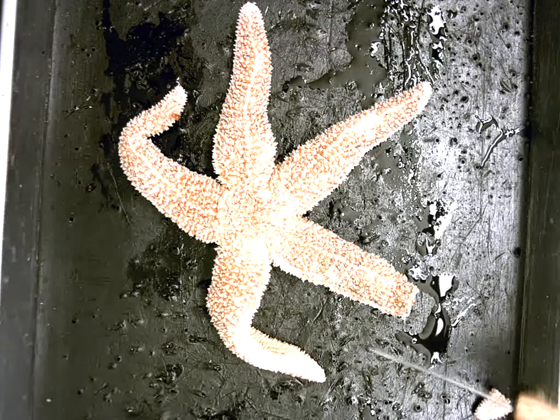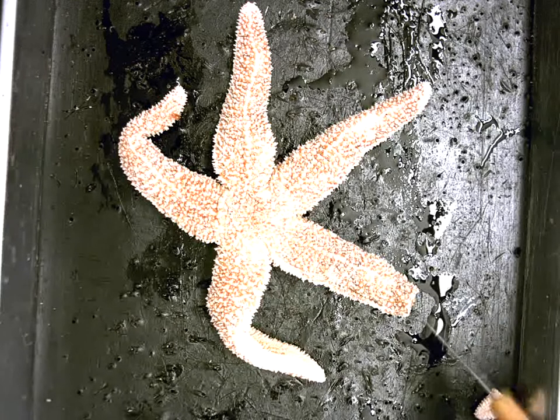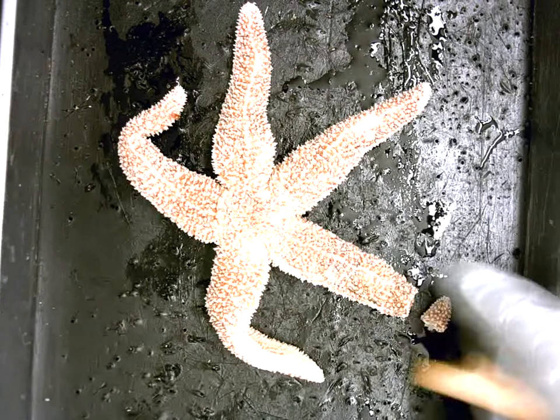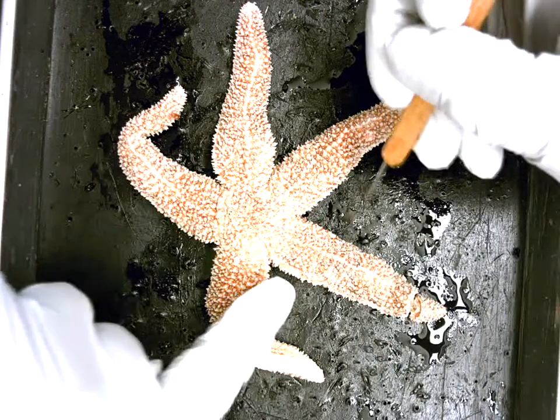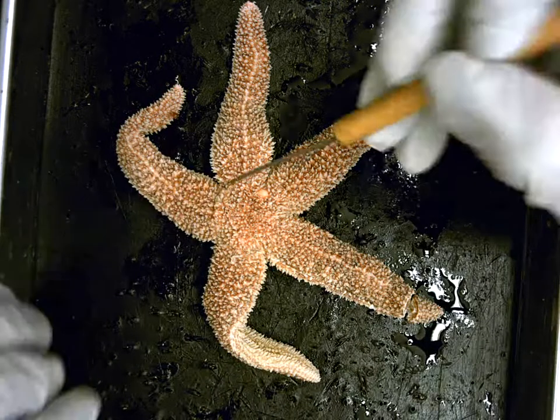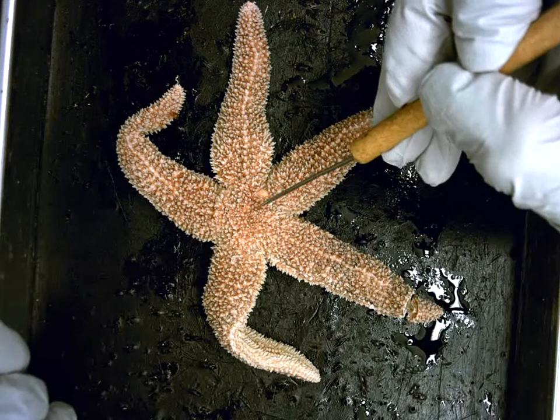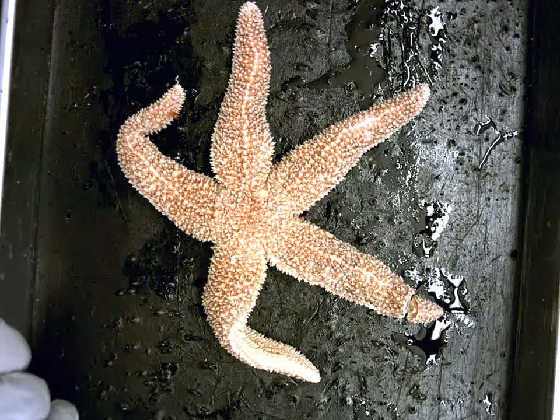Here we have the ab-oral surface, and we're going to do part two: internal anatomy. In order to do this, I used scissors and cut off the tip of the ambulacral arm right here. Then I cut up the edge of both sides and cut around the central disc. I made sure to do a little curvature right around the madriporite here in order to not damage the water system.